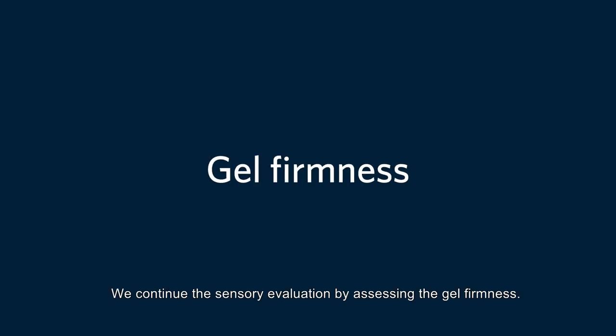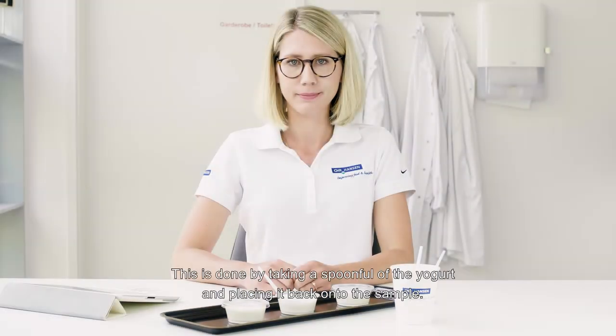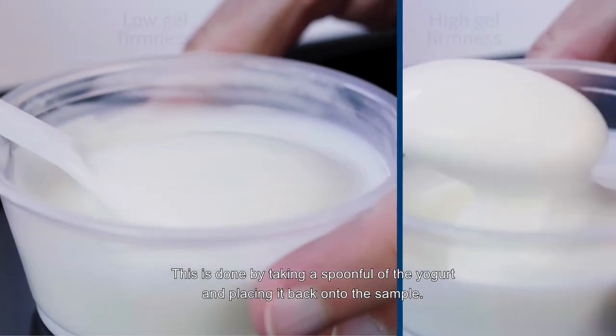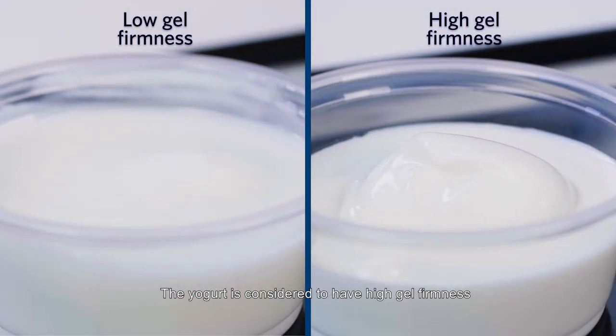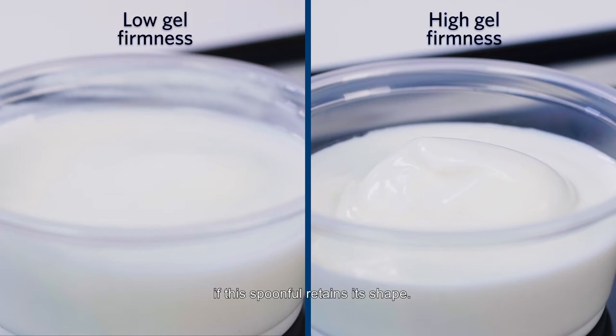We continue the sensory evaluation by assessing the gel firmness. This is done by taking a spoonful of the yogurt and placing it back onto the sample. The yogurt is considered to have high gel firmness if this spoonful retains its shape. Conversely, if the spoonful reintegrates quickly, that indicates a low gel firmness.